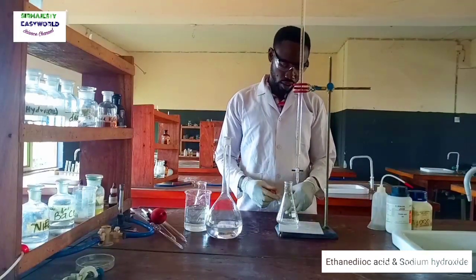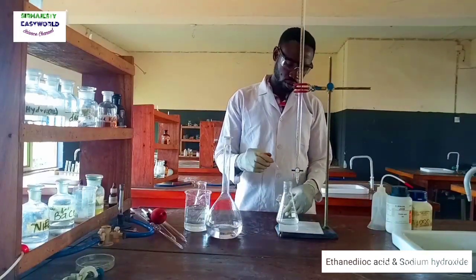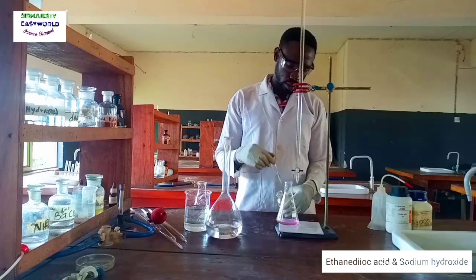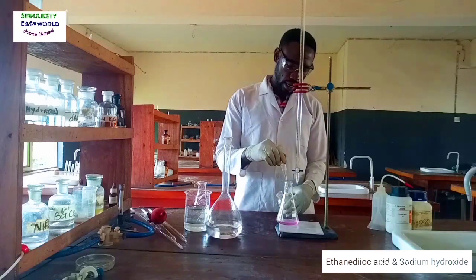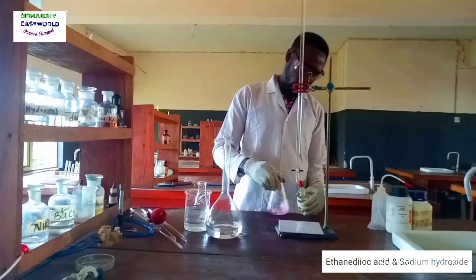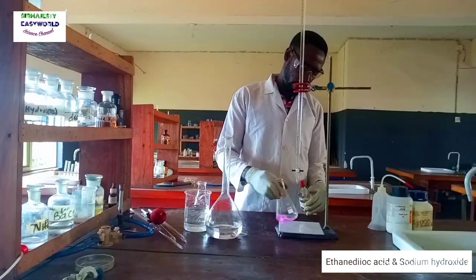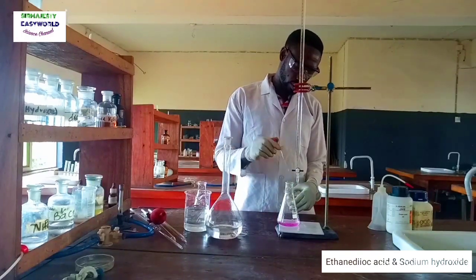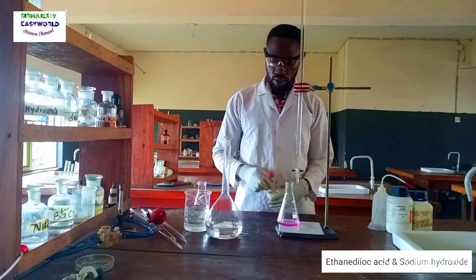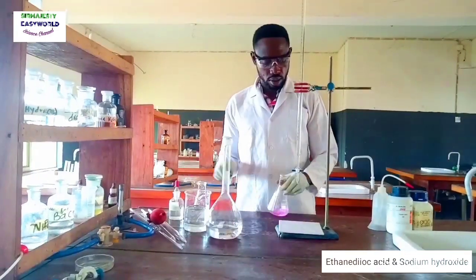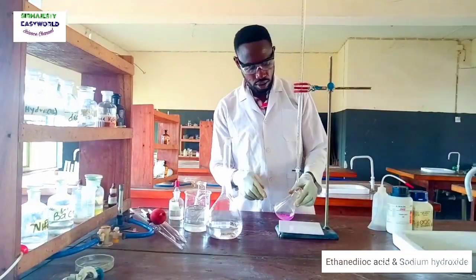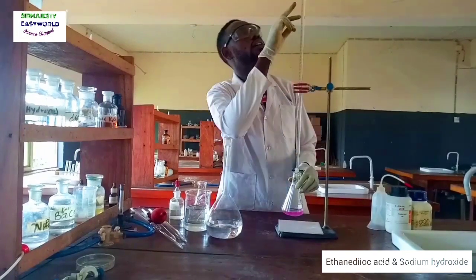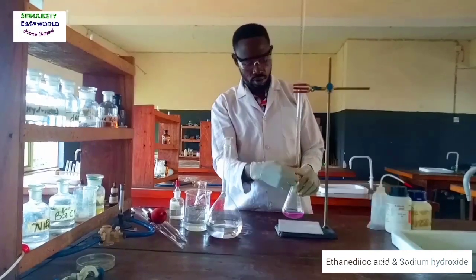Add the indicator. Remember not to add too much, to get a clear and accurate end point. Although this is a bit weak, I want it to indicate well. Initial reading is 0.00.